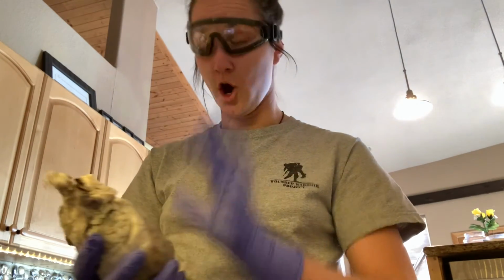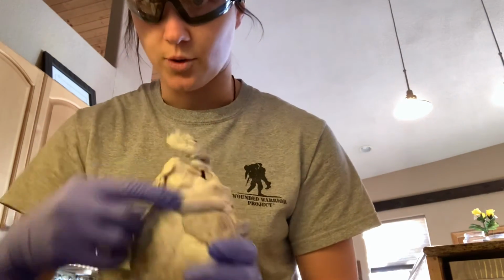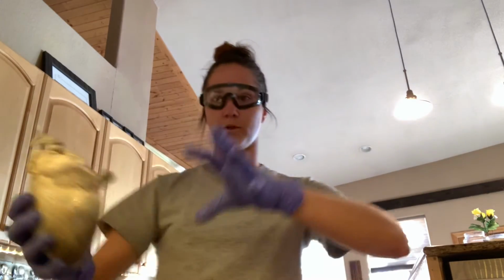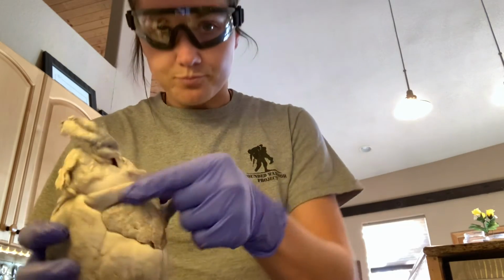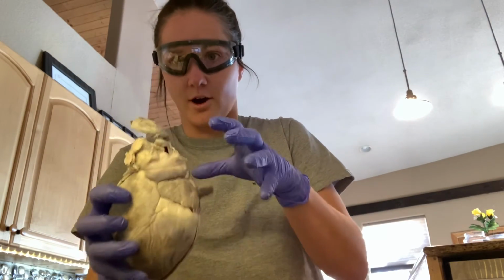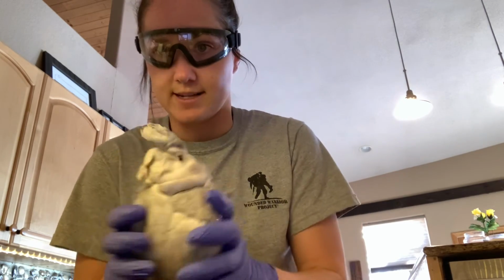And one more thing. We have the coronary arteries. So this right here is a coronary artery. The heart gets blood to pump to the rest of the body, but the coronary artery carries the blood that the heart uses to function, through this right here, and that's the aortic artery.